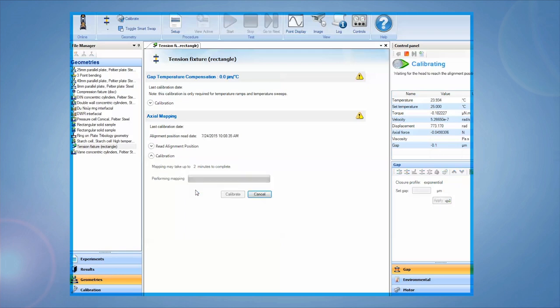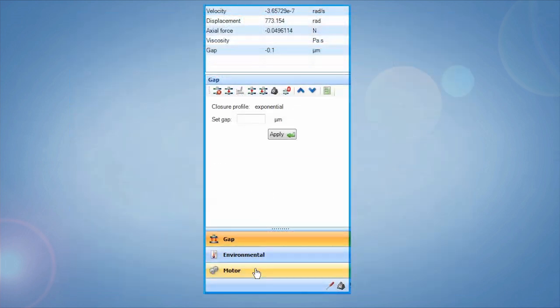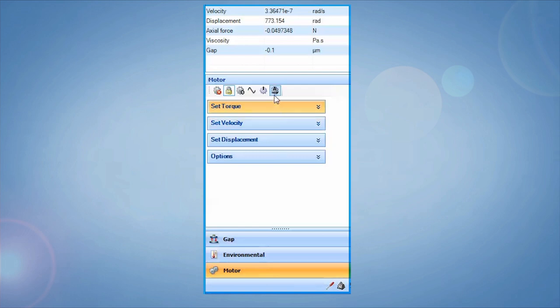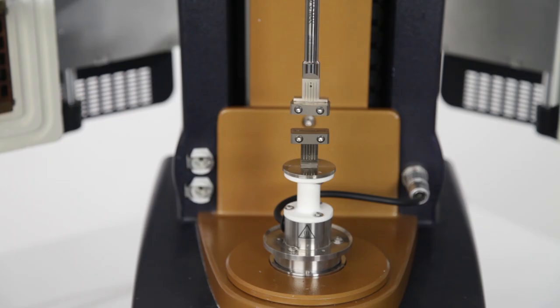You can now use the move to alignment position button in the motor control panel at any time to return the geometry to the alignment position. This guarantees the geometries are always aligned with one another during testing.